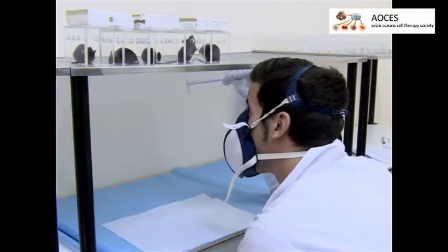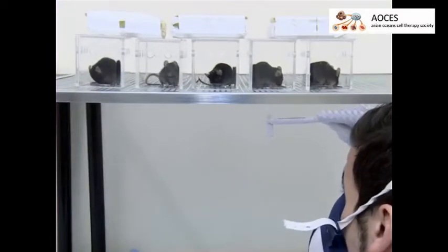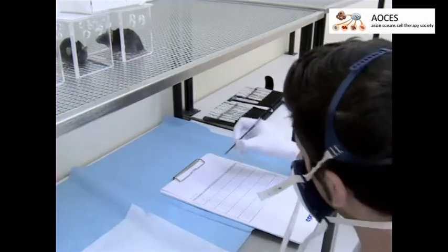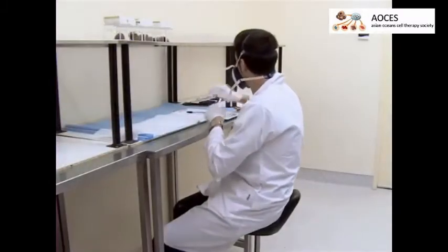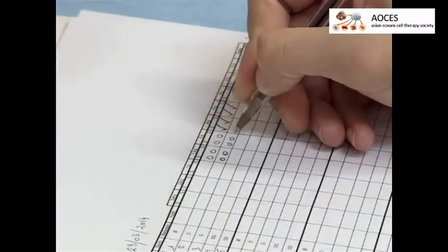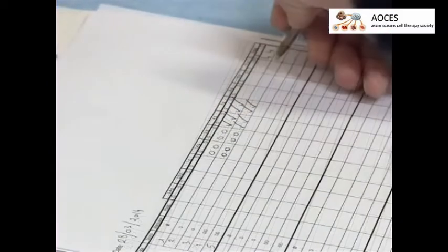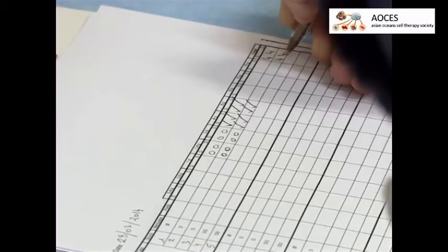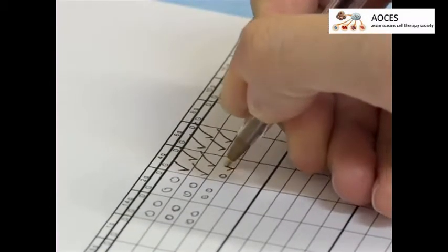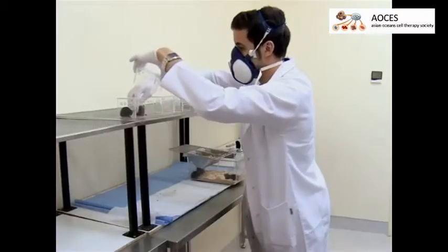If the animal reacts to all three applications, test the other paw; otherwise apply the filament a total of five times before testing the other paw. Test each mouse consecutively with the chosen von Frey filament, then repeat the process with the next filament. If an animal reacts three times to the same filament, this is considered a positive outcome. When two consecutive filaments get positive scores, stop testing on that paw.